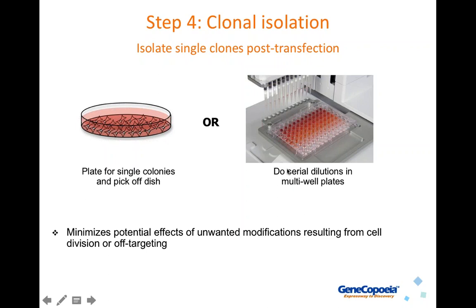If you're working with suspension cells, it's a little bit different. We then recommend doing serial dilutions in multi-well plates. And again, this is very important. I can't emphasize enough how important it is to do clonal isolation because it minimizes the potential effects of unwanted modifications resulting from cell division or off-targeting.